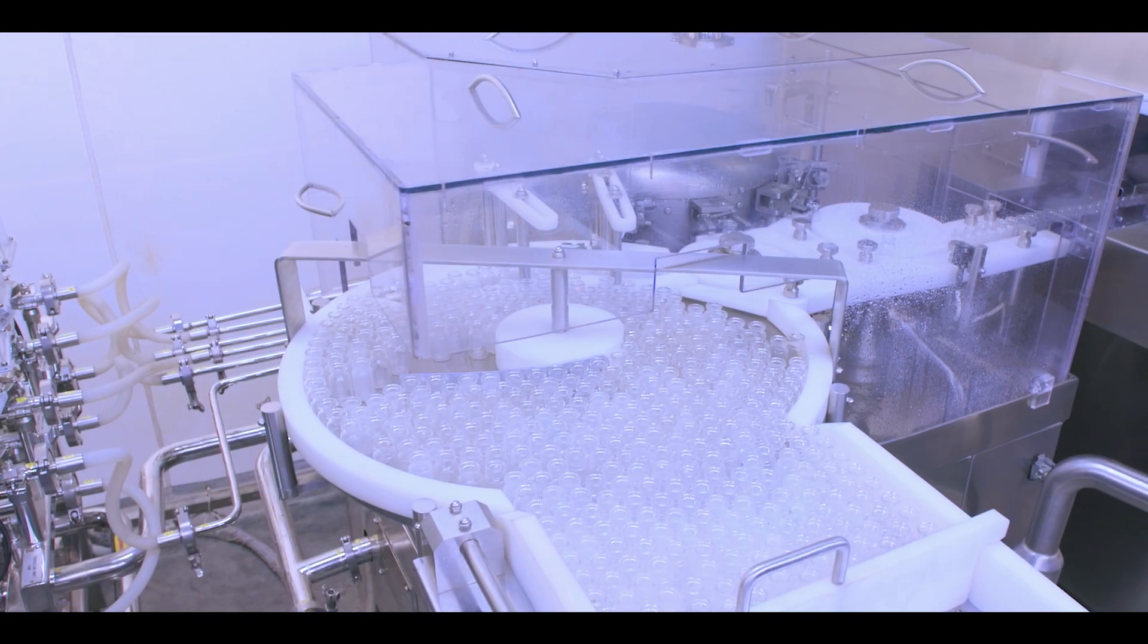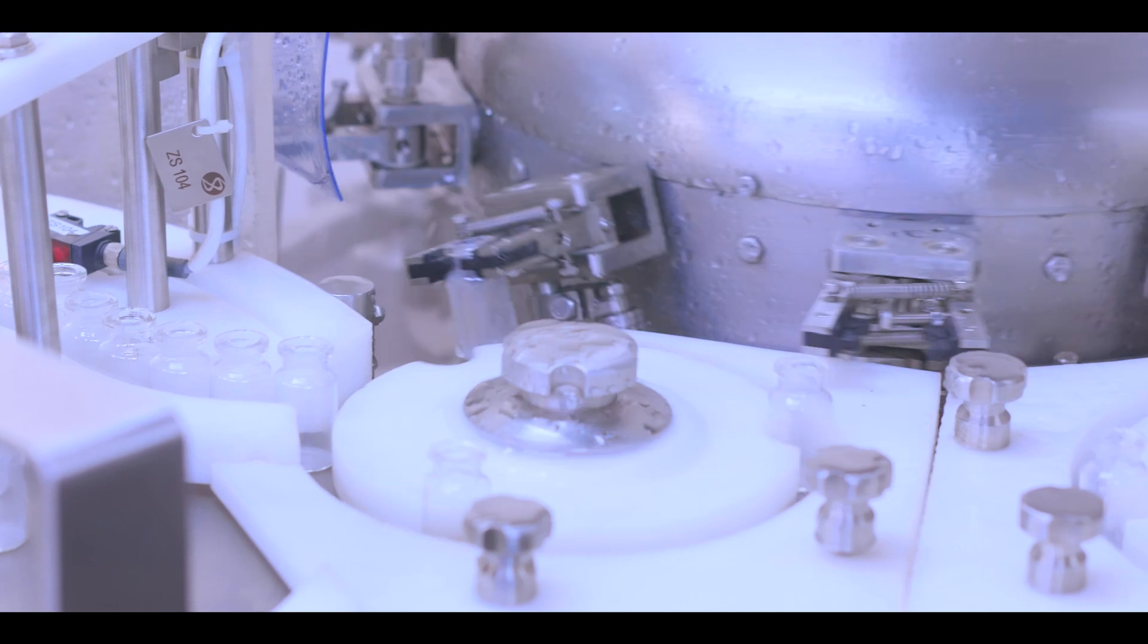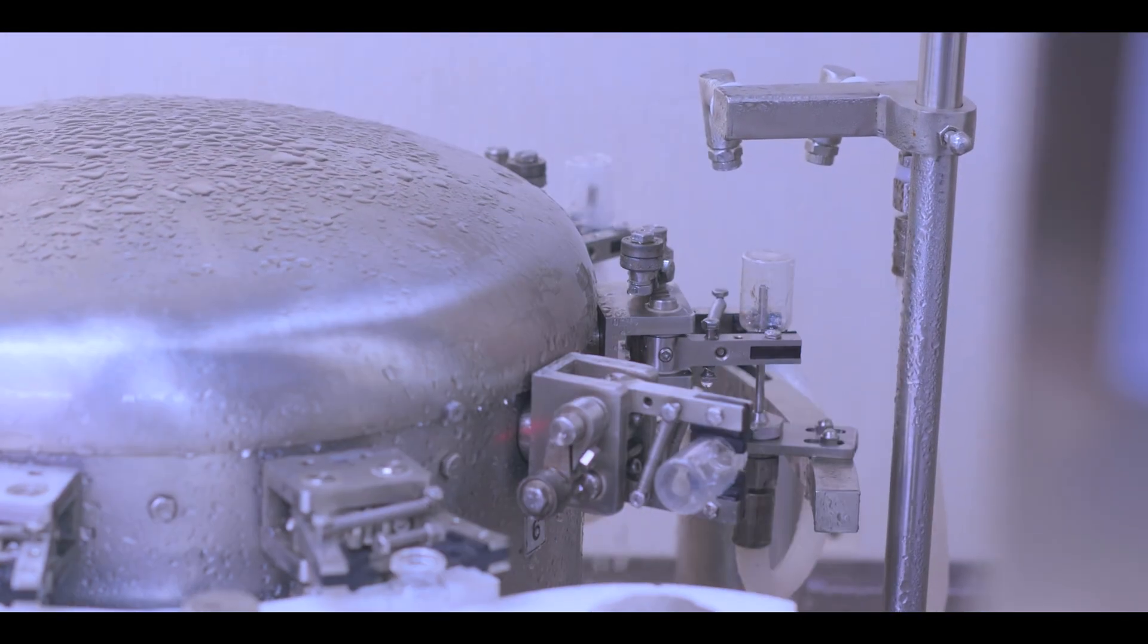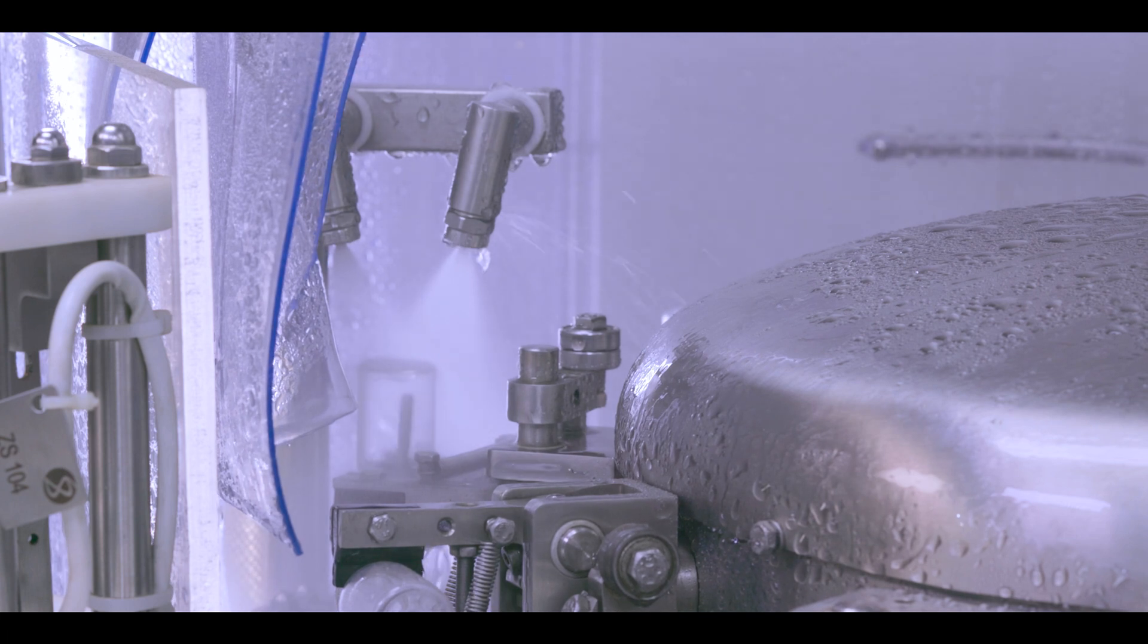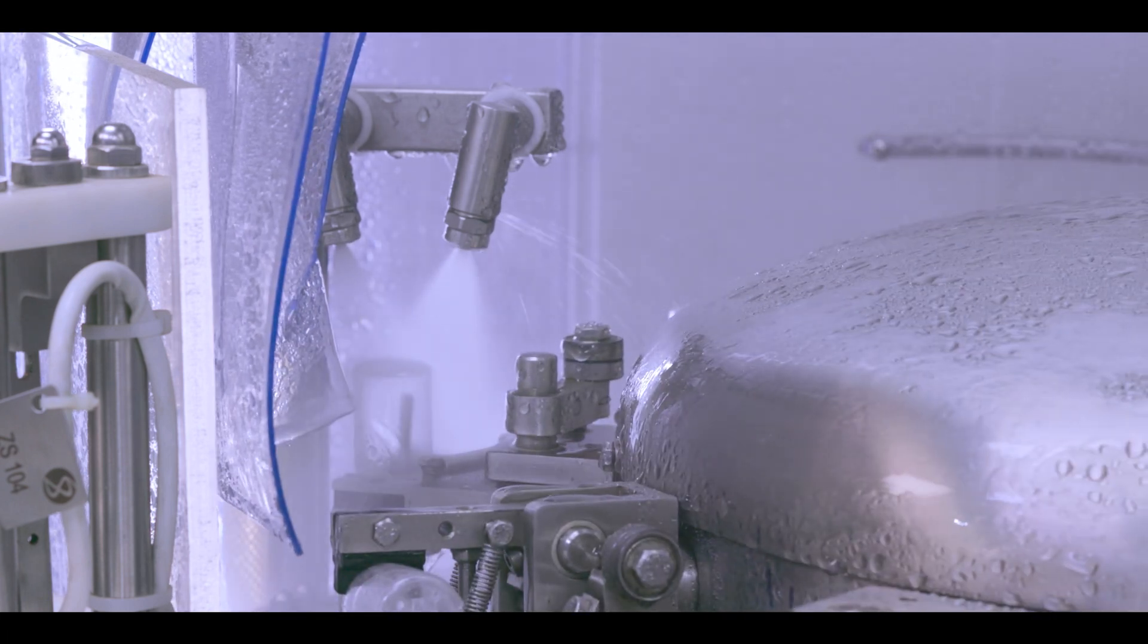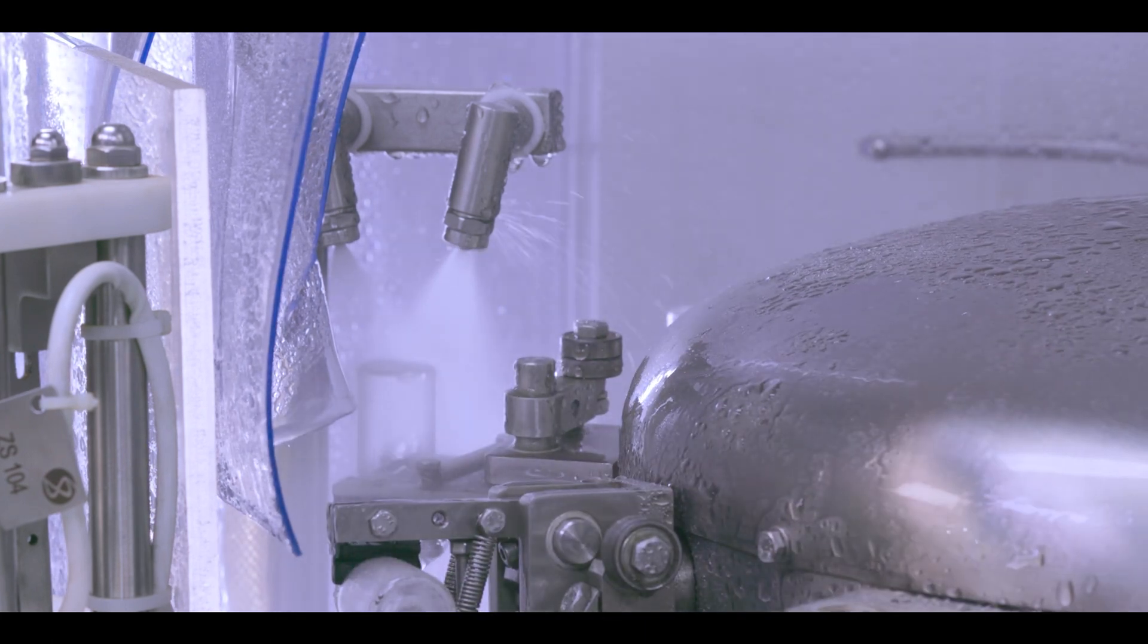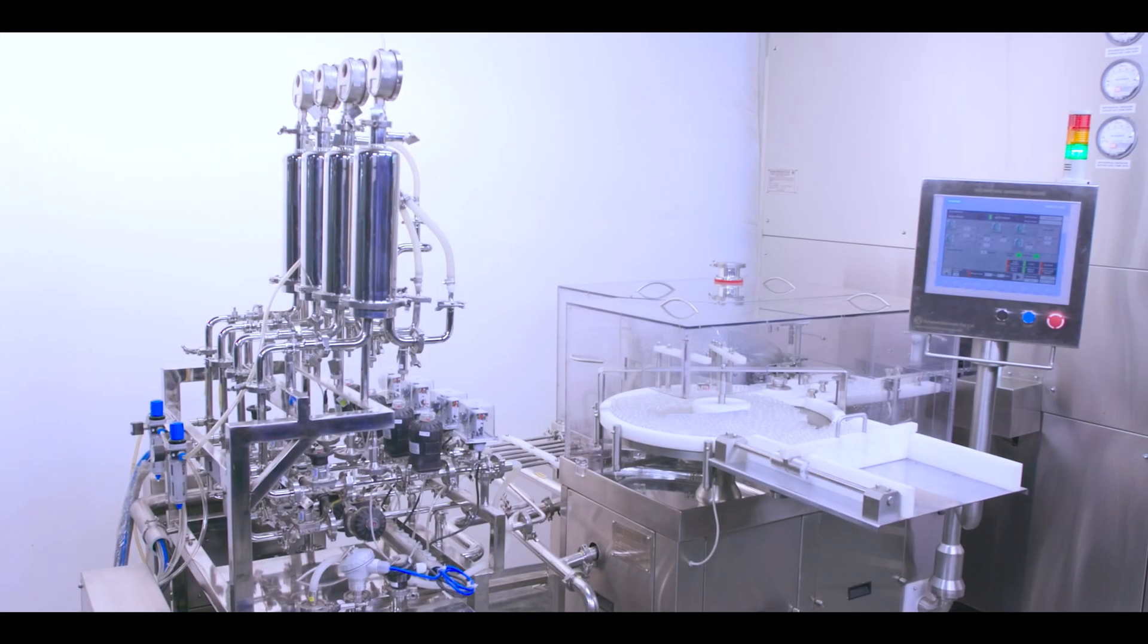A vertical rotary vial washing machine washes the vials that are manually fed to an infeed turntable. The vials are cleaned internally and externally with recirculated water, purified water, water for injection, and compressed air.